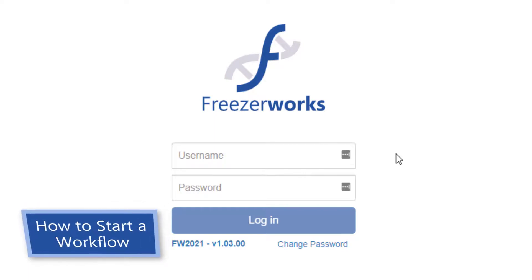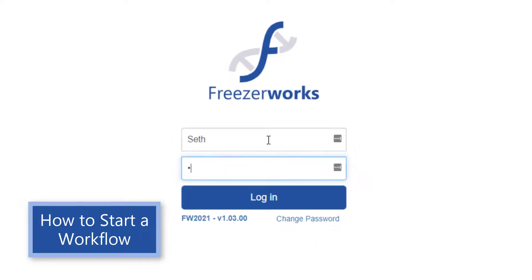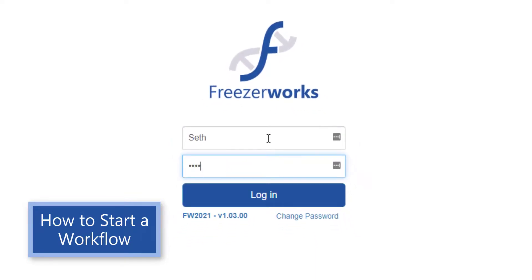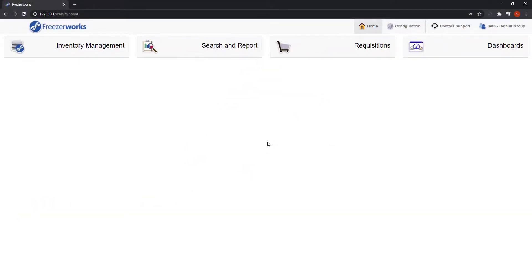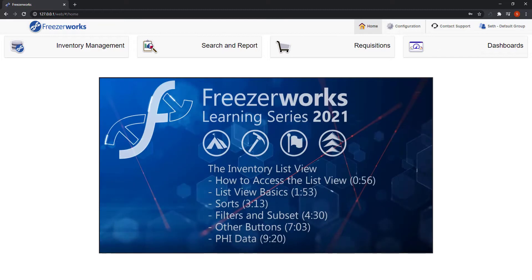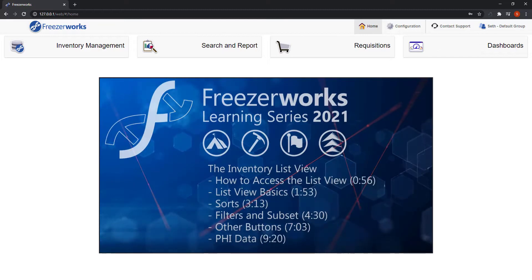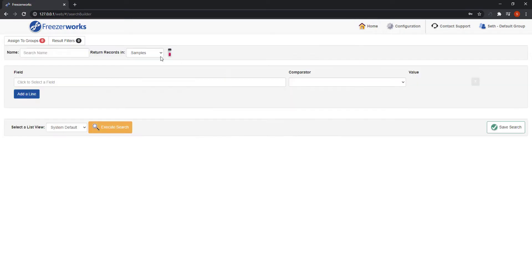Let's imagine we have all the templates we need and we want to process workflows remotely now. Let's log into the web client. The first way you can process a workflow on the web is from the inventory list view. For a deep dive on how to use the inventory list view, see our video of the same name. For now, let's create a search for records we want to process a workflow on.